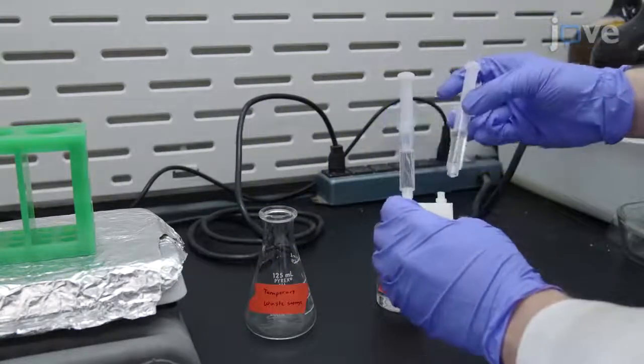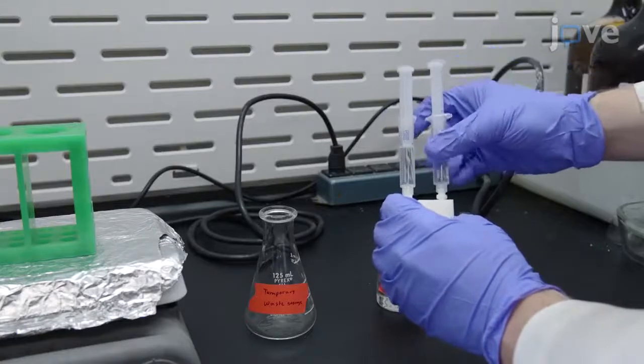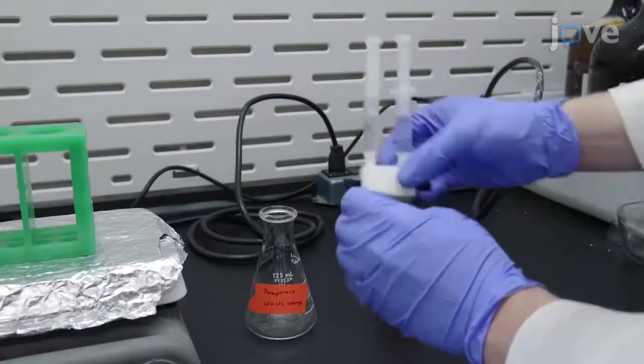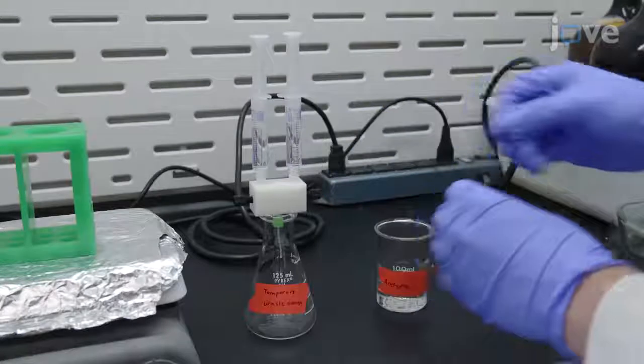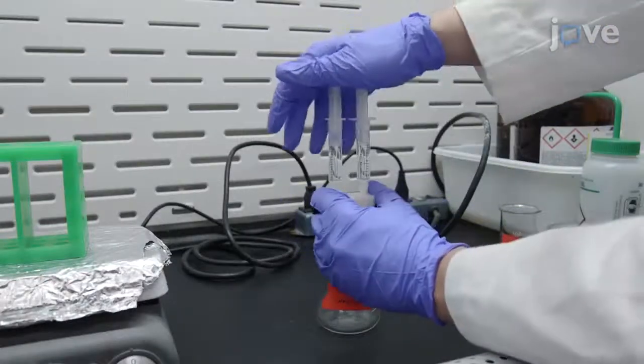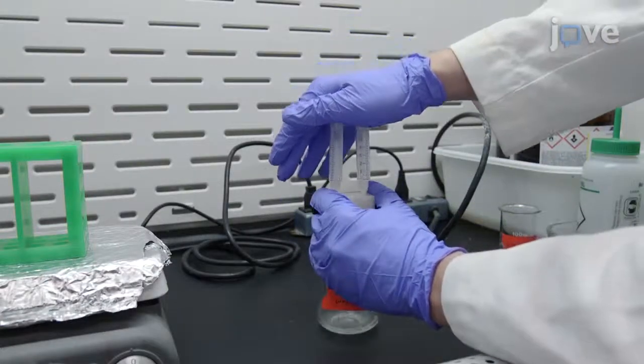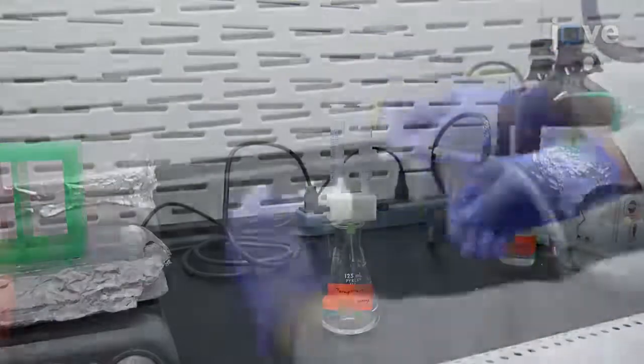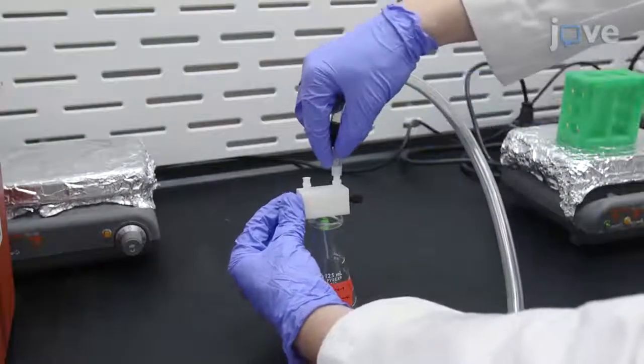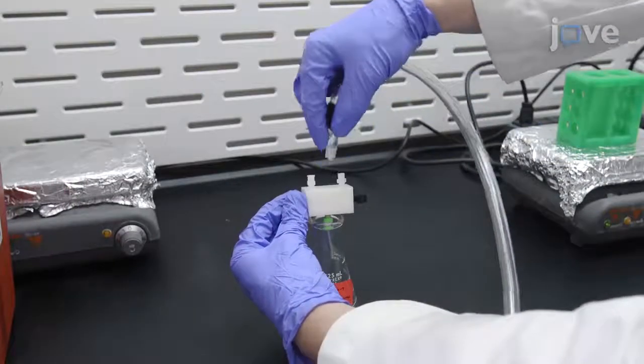Lock the syringes into the inlet adapters and set the assembly over a waste container. Steadily depress the plungers to send the solvent through the mixing chamber over the course of a few seconds. Then, remove the syringes and dry the mixer with a stream of nitrogen gas.